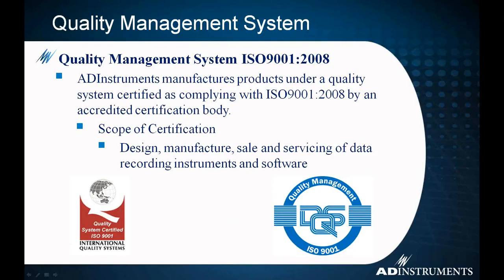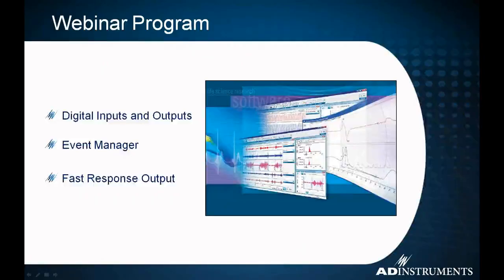So if you ever have somebody ask about this in one of your labs or anything like that, definitely point them to this. We do have these certificates on our website, so it's a great way to say that, yes, what we know is accurate we're getting from LabChart and PowerLab.